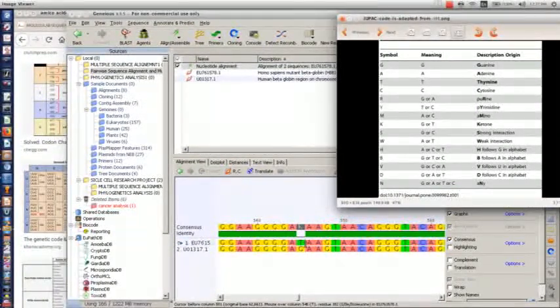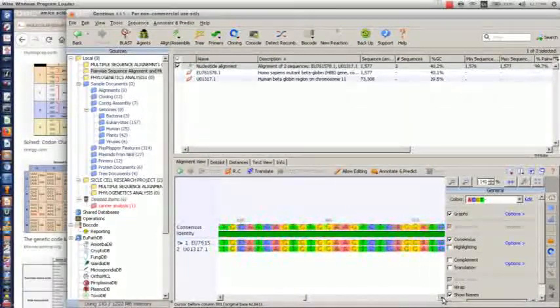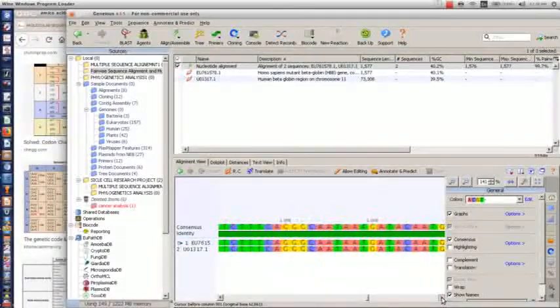So we move on to the next one. Keep going until we find another issue. All these places are conserved and aligned, so there's no issue with those regions. Whenever you see a gap on the graph, that means there's an issue, just like this.